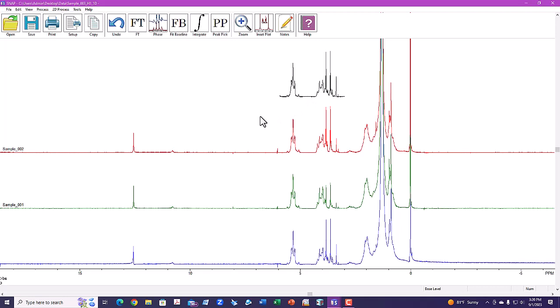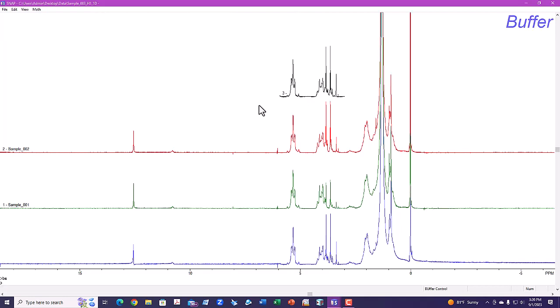If we decide, oh, I really wanted to add a 4th spectrum and I wanted to add the whole thing, remember we go into buffer mode, have the mouse just move through it so it flashes, and you can type the letter D for delete, actually probably under the pull-down menu, delete current buffer. And by current buffer, it means the last one that you move the mouse through.